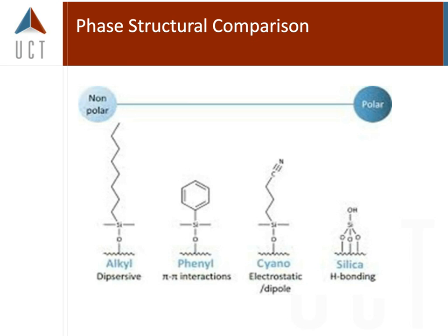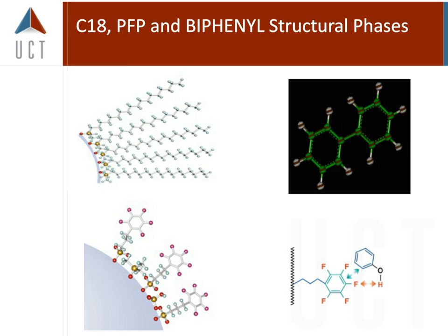So we're able to then use those like-attracts-like connections to have these attractive forces be useful, especially in liquid chromatography. So you start to see phenyl groups, fluorinated phenyl groups or biphenyl groups being used in LC columns. So this aromaticity is important. And I will try to get across a little bit of why this is important in terms of using the LC columns and picking these and try to associate them with some of the solid phase extraction procedures.